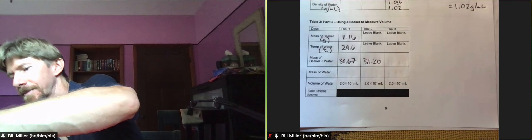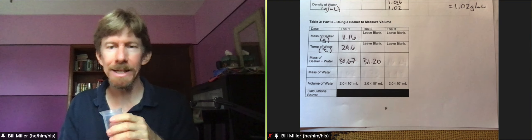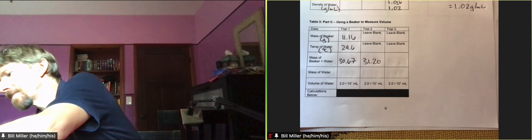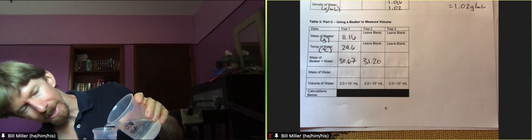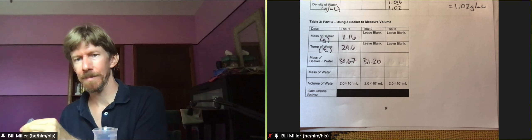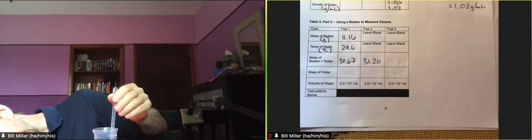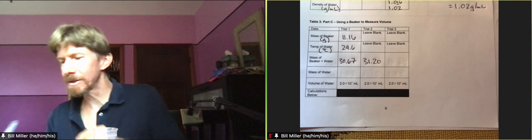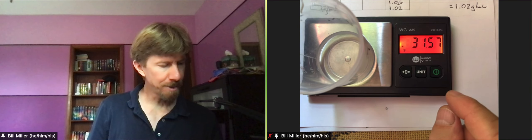Pour that into the waste. And you don't have to dry it again. You can. It shouldn't make a difference. Because any water that's in here is going to be part of the 20 that I'm pouring back in. And so let's see if I can do this a little better this time. It might be a little better, but I still have some extra in there. So I still want to take some out because it's a little above the 20 line. Get it as closely as you can. And then weigh it again. There's the dot. 31.57.